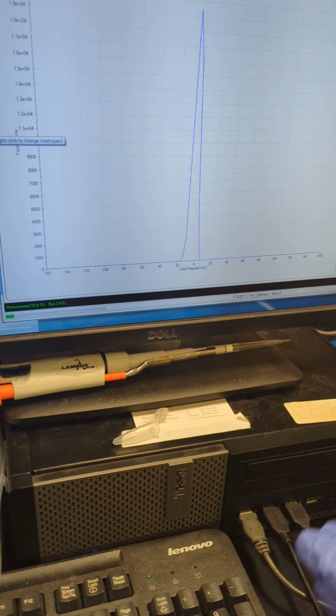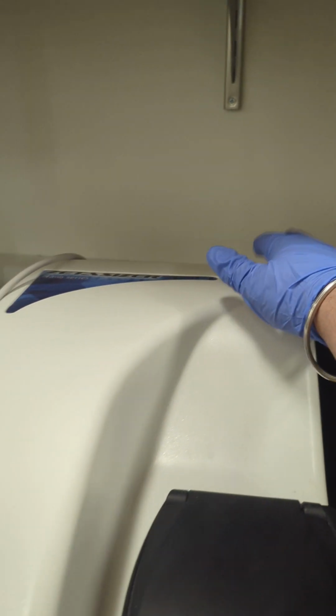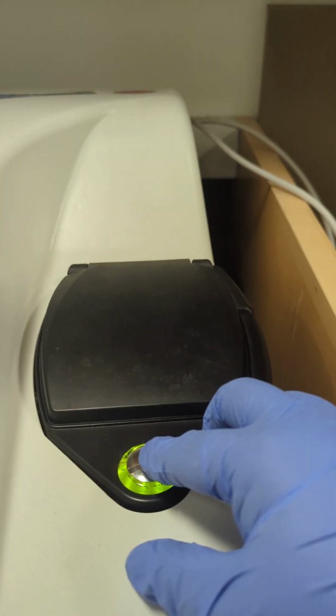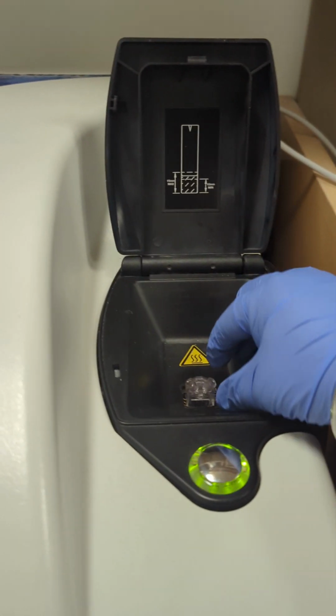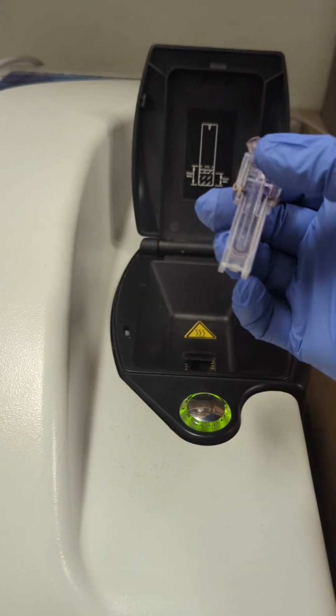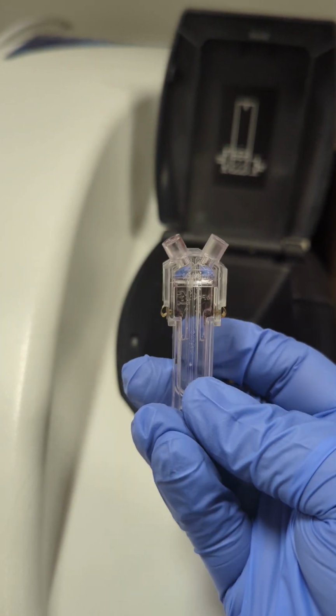And then here comes the machine itself. There is a switch just beside this to switch on the zeta potential machine. Now I'll show you how we put the sample inside the zeta potential machine. Here is the typical chamber for putting the cuvette with the sample. You can see that I have filled the sample until this point.